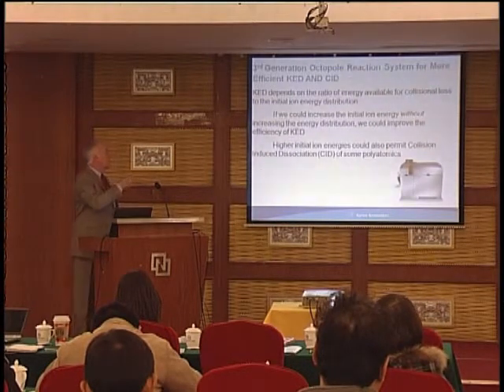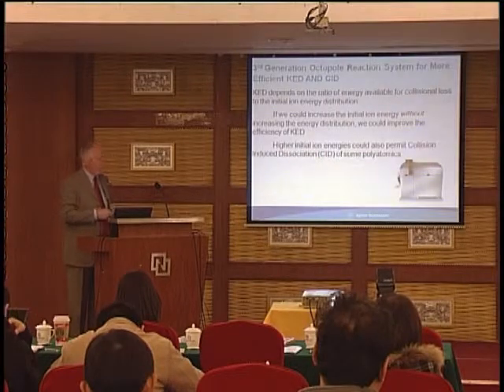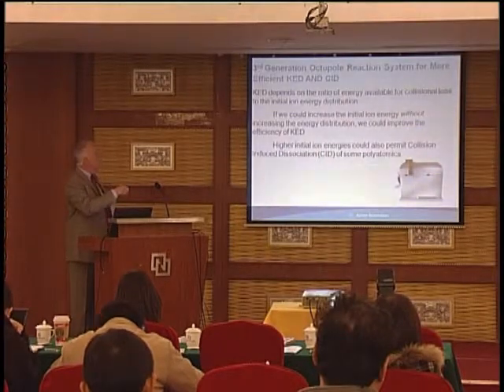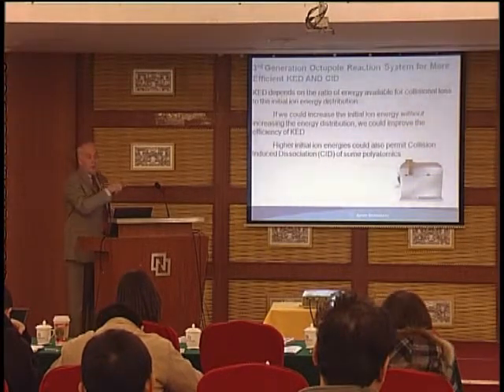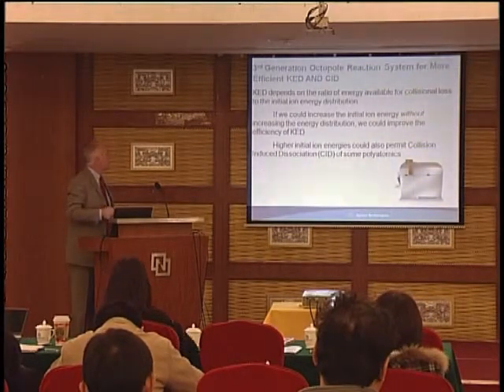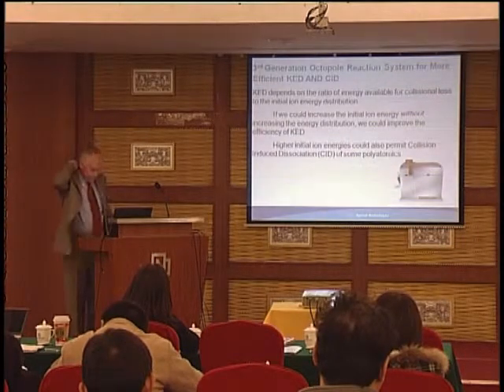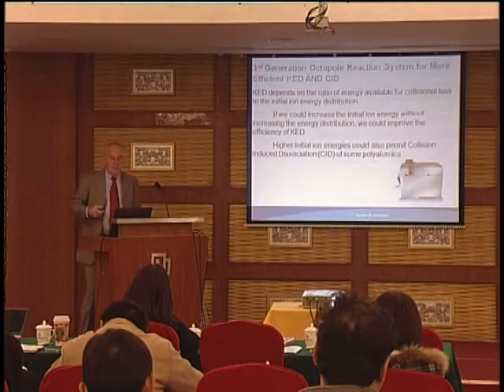And all that went into this third generation system, the Agilent 7700. We've got this octopole reaction cell with optimized conditions for helium flow. We can use it with or without the high matrix interface that I just showed you.